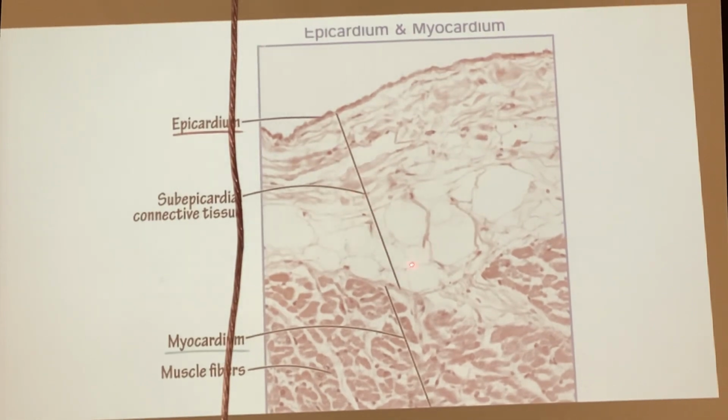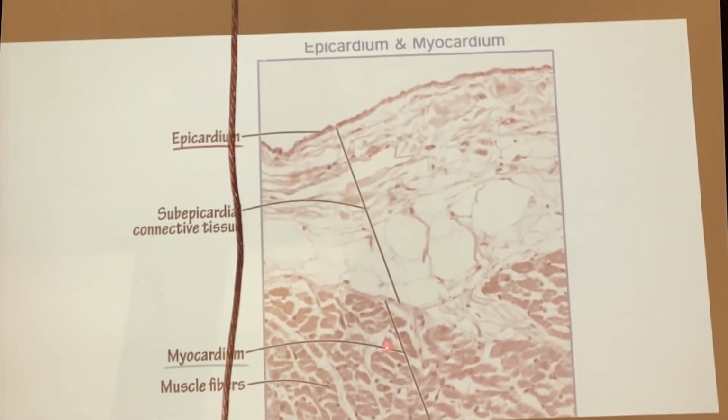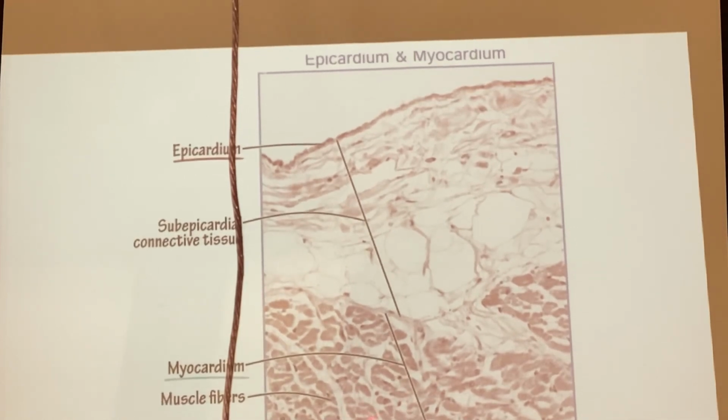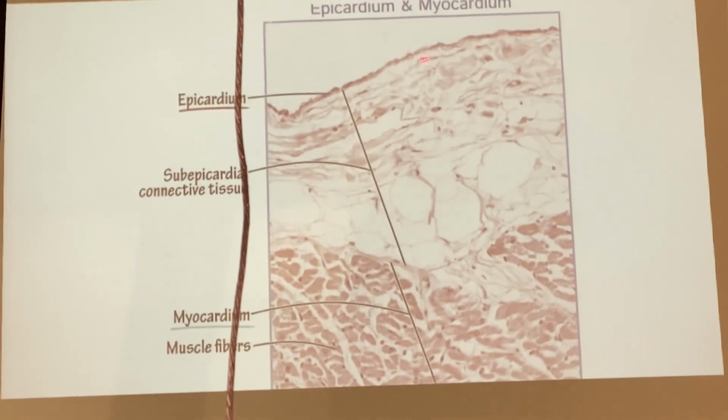Epicardium, subepicardial connective tissue, myocardium. These are the myocytes. Now, look at there.